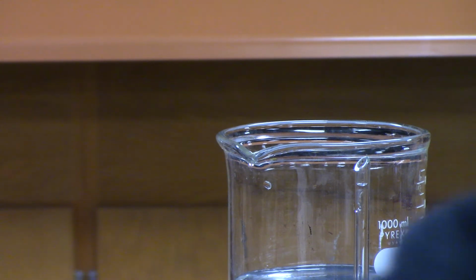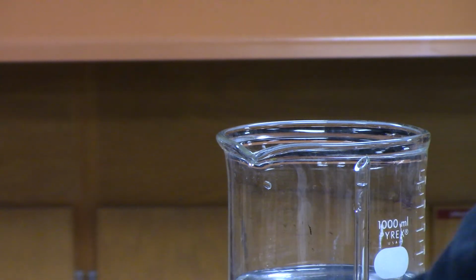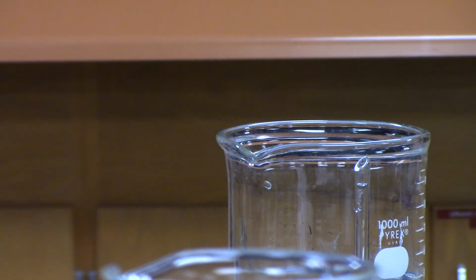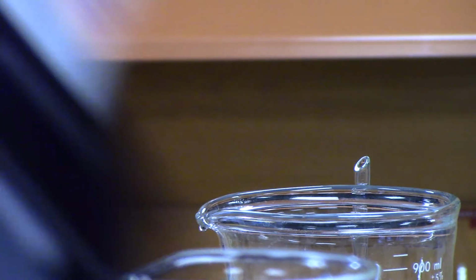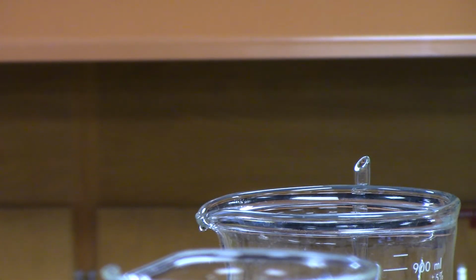So again, I'm going to use my beaker. I already rinsed it out. Now I'm going to add about 100 mils of water. Stir bar. And then I am going to take up 25 mils of my solution.